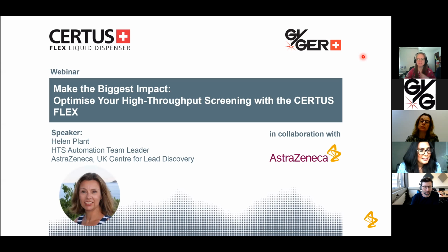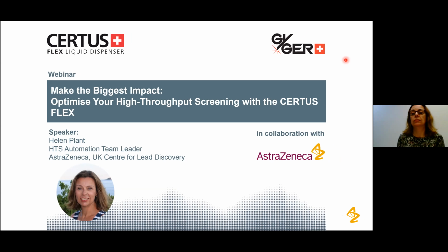So Helen is the UK team leader for automation. She's based up in Alderley Park in the UK. We've known Helen and the team for many years, since 2015, and over the past 6 years we've been working in close collaboration with Helen and the team. During our collaborations we've enhanced the flexibility of the CERTUS FLEX, and it's also enabled us to get a closer look and an insight into actually what is needed onto the HTS workflows. So let's go straight over to Helen, so she can tell us in more detail about the CERTUS FLEX and how it's implemented in the HTS workflows.